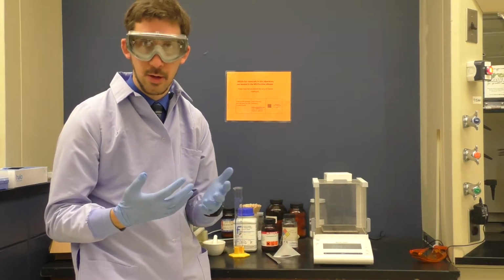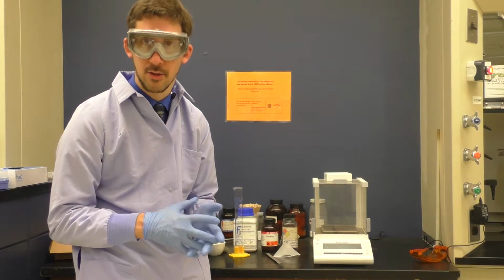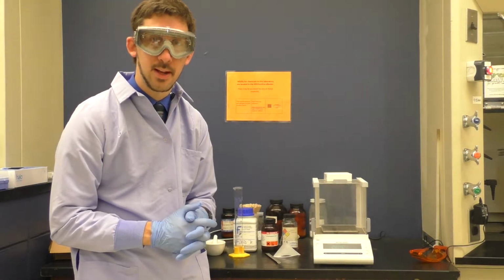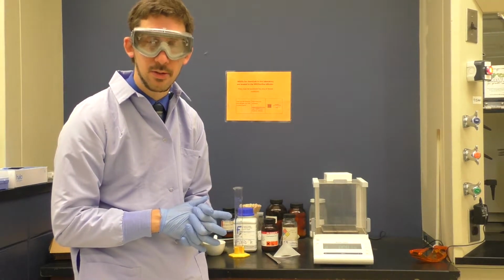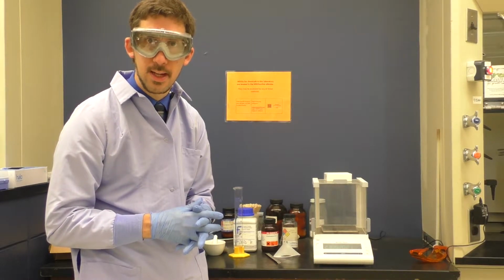Now, the 4-aminophenol is not soluble in water, but we're going to add concentrated hydrochloric acid to protonate the amine and make it water soluble. That will dissolve all of that 4-aminophenol. Now it's the protonated anilinium salt, technically, or the aminium salt. That will be dissolved in water.